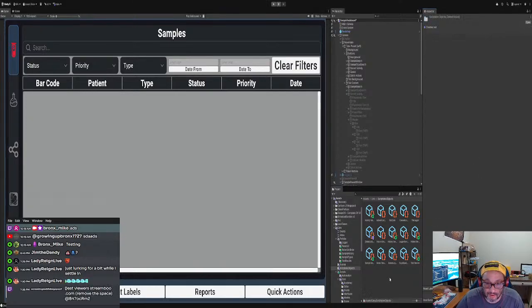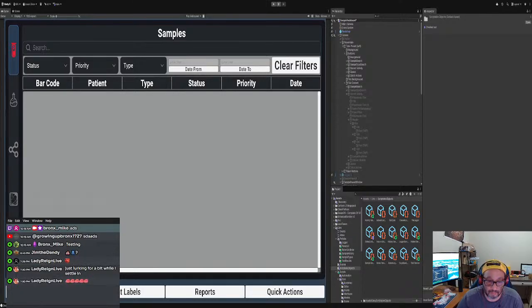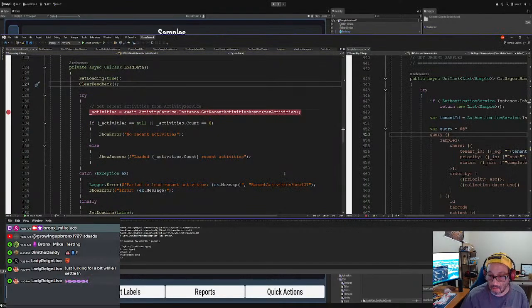But do we have a queue? Okay. All right. So then we have queue services. We should have a queue service. Patient activity. Let me see.